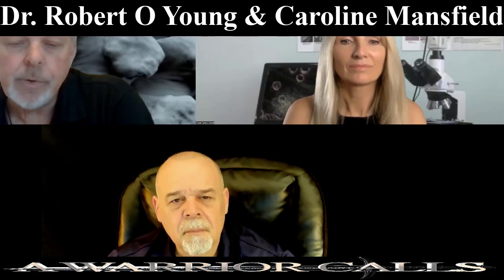But here again, it's very easy to get confused about whether or not the zeolite is zeolite or graphene, because guess what? The graphene is also hexagonal structure, very similar, but just an opposite polarity. I can show you what that looks like. I think I can, if I've got the ability to share here. Let me see if I've got that screen up. One second. Okay, let me just take a minute and find that.